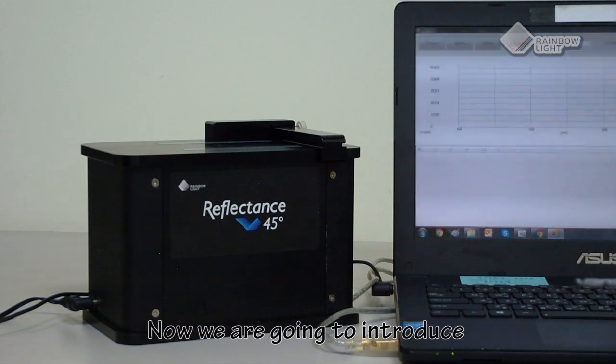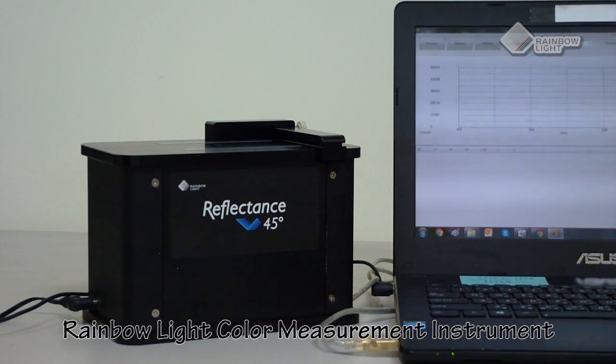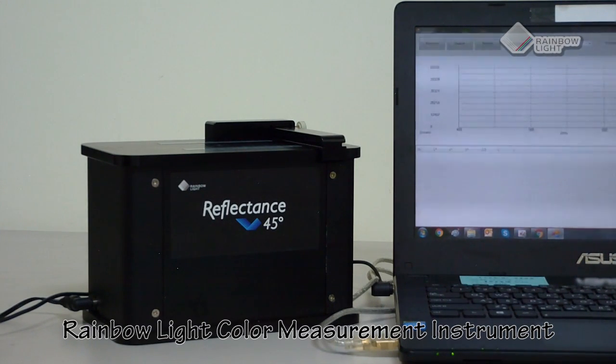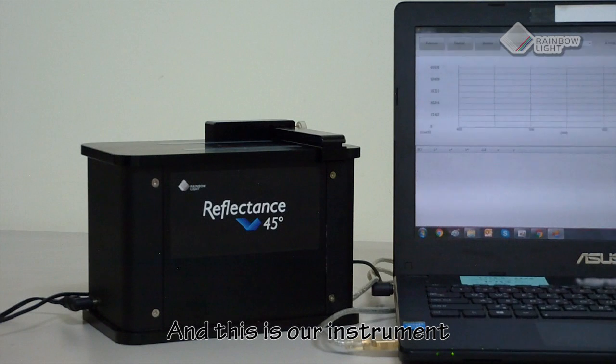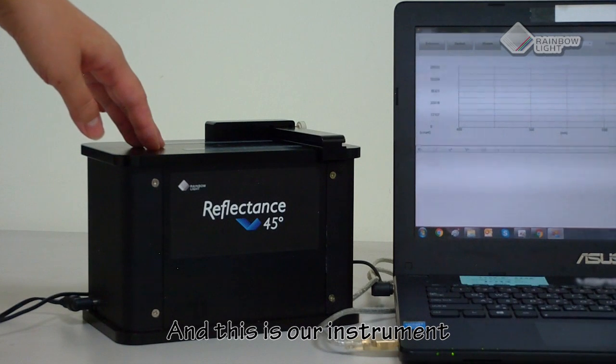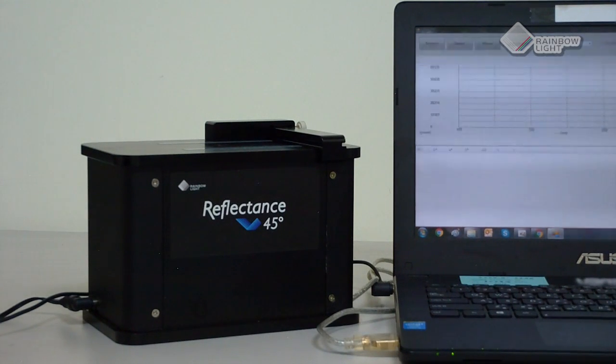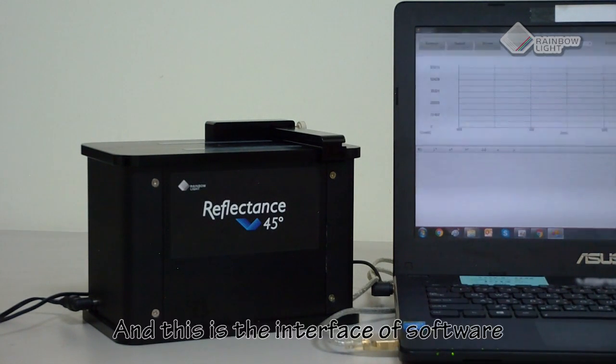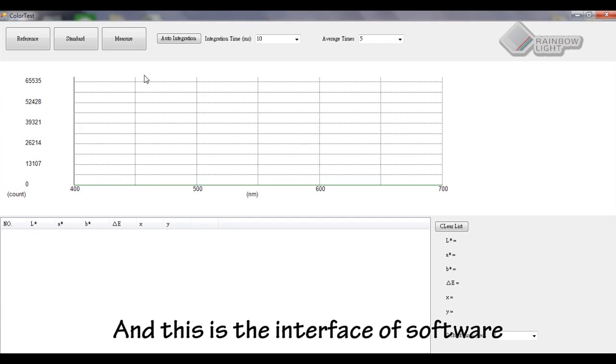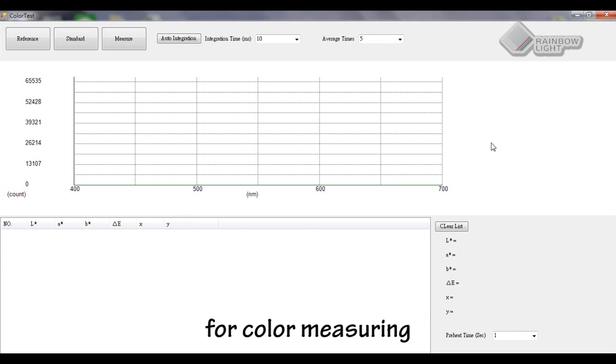Now we are going to introduce the Rainbow Light color measurement instrument. This is our instrument, and this is the interface of software for color measuring.